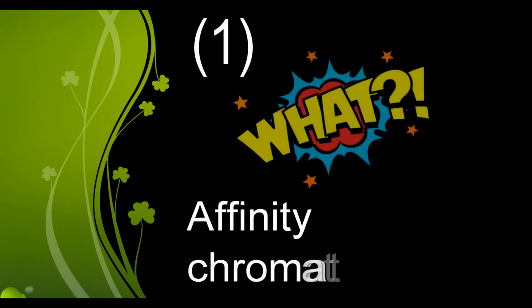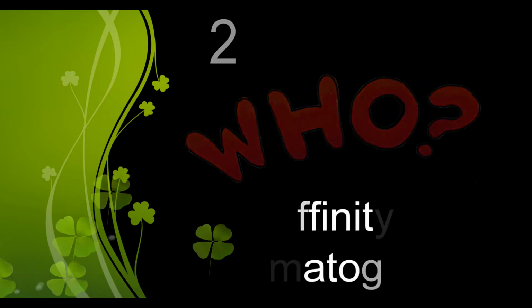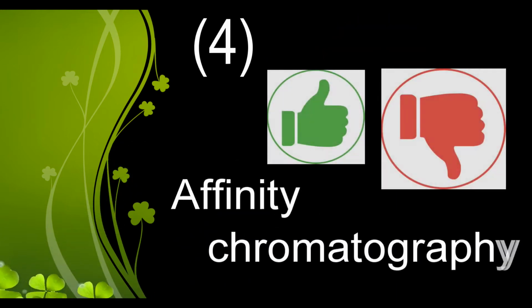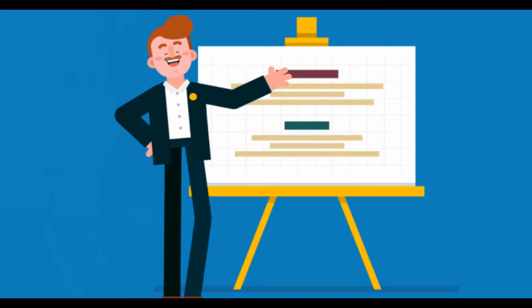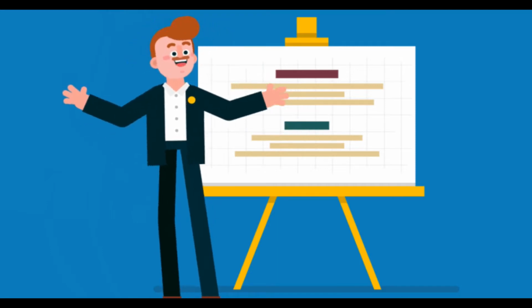In this in-depth video, you will learn first, what is affinity chromatography, who discovered affinity chromatography, what is the principle of affinity chromatography, how does affinity chromatography work, what are advantages and disadvantages of affinity chromatography, and what are applications of affinity chromatography. So if you are ready to go all in with this video, let's dive right in.